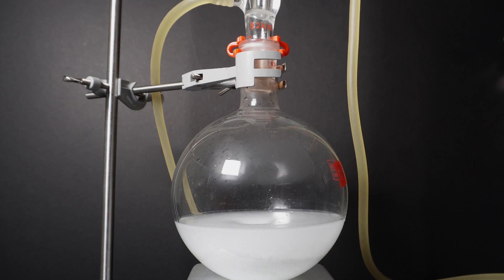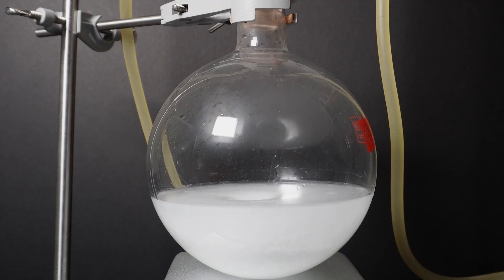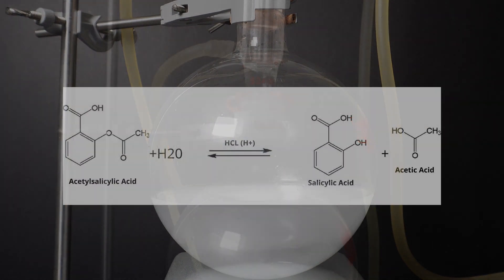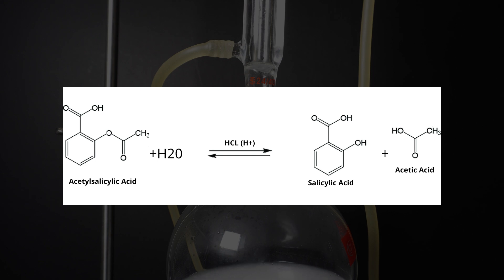We are going to reflux the solution for about 30 minutes. However I will not start my 30 minute timer until I see the first signs of phase change in my condenser. The benefits of refluxing are being able to keep a mixture boiling without losing any of the solvent.